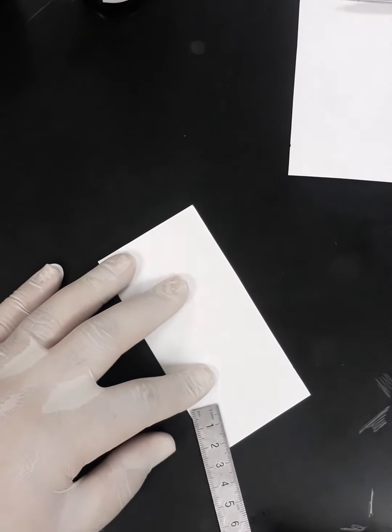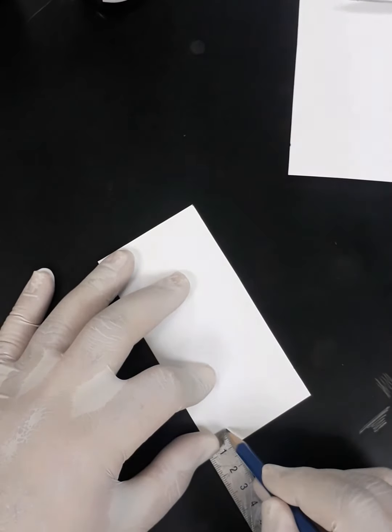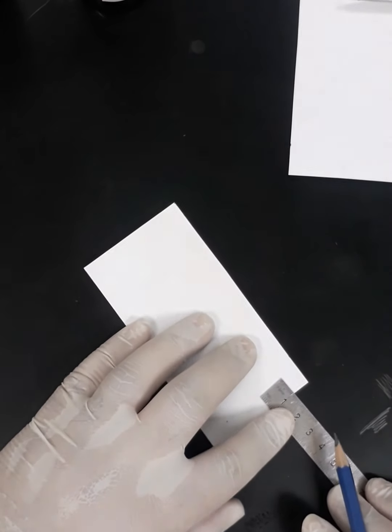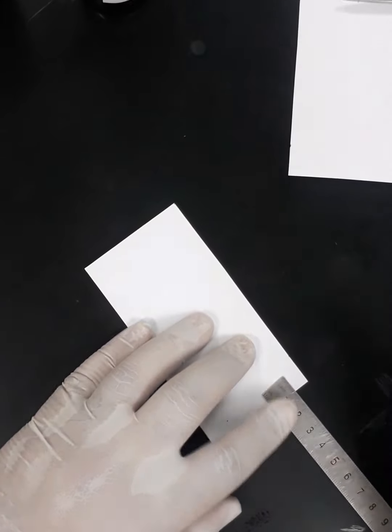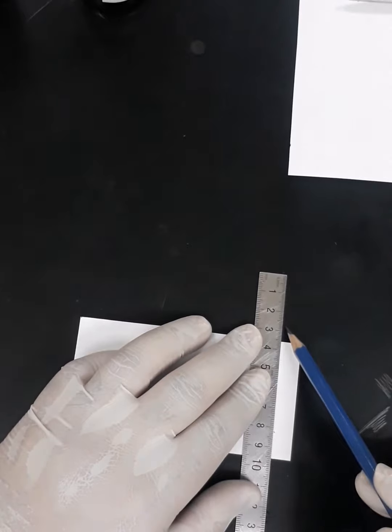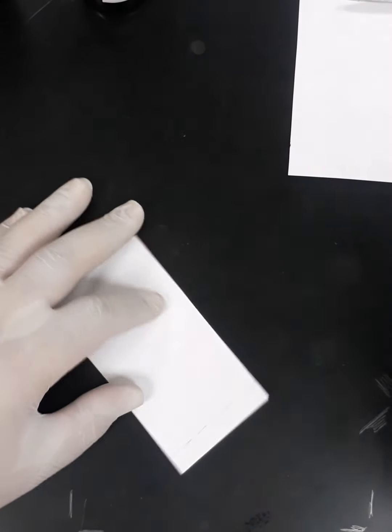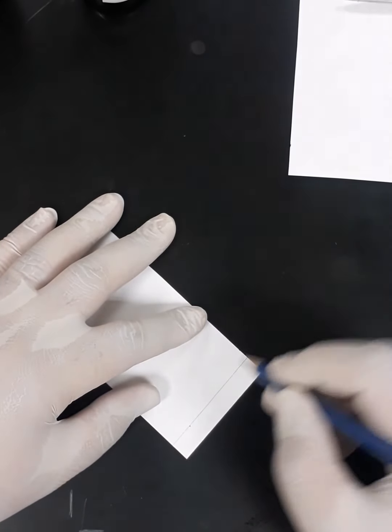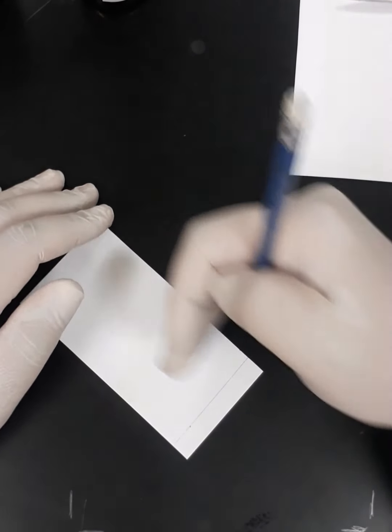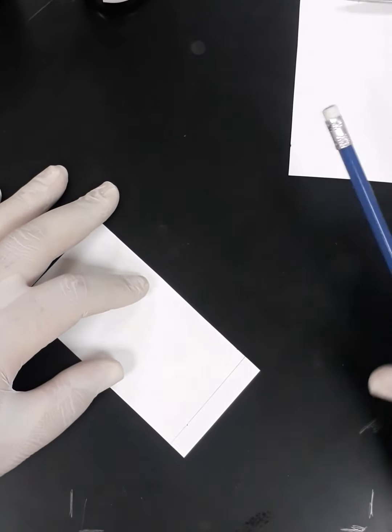Now I will measure 1 centimeter from the bottom line, and then I will mark it here, and then again here to get a straight line. I will mark it here, then I will draw a straight line. This line I'm going to draw right now is the baseline. Why do we call it baseline? It is exactly like the start line of a race. So we have to put all the spots on the same level, so when they develop, whatever distance they cross will indicate their similarity to the standard or the sample spots.